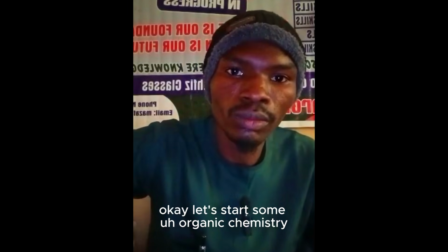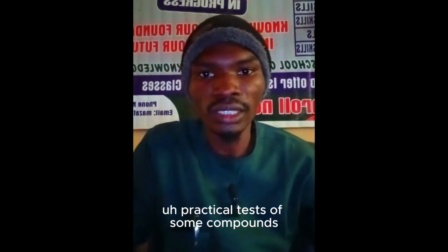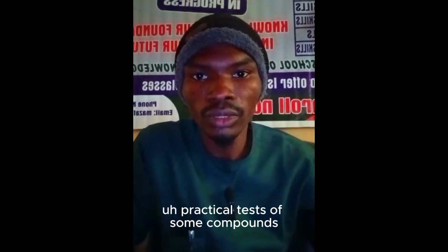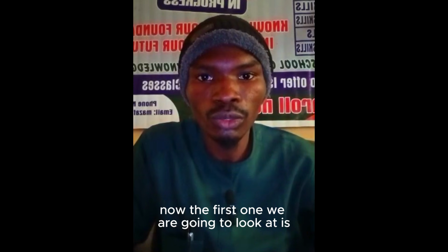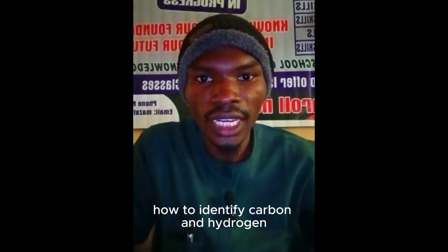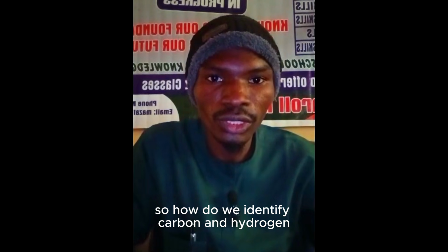Okay, let's start some organic chemistry practical tests of some compounds, how we can identify organic compounds. Now, the first one we are going to look at is how to identify carbon and hydrogen. So how do we identify carbon and hydrogen?